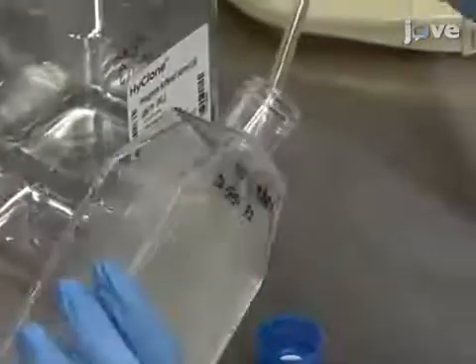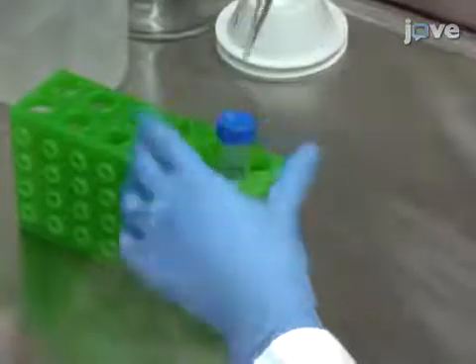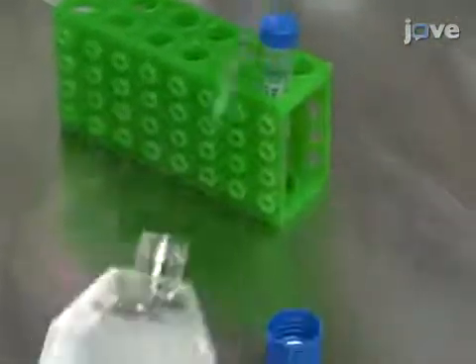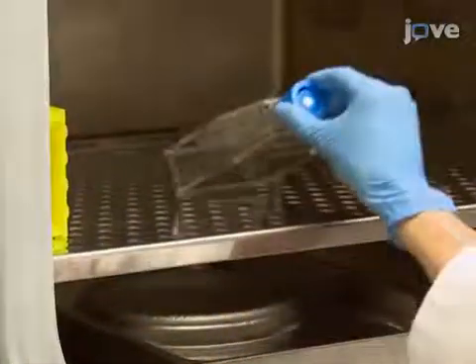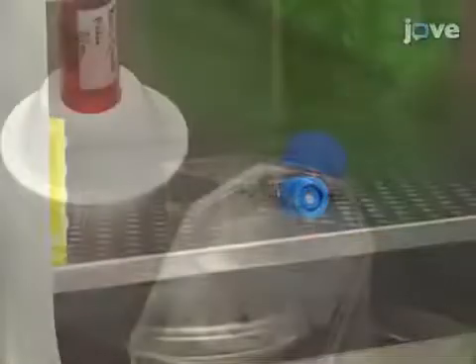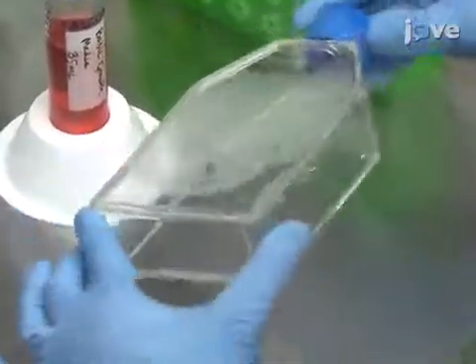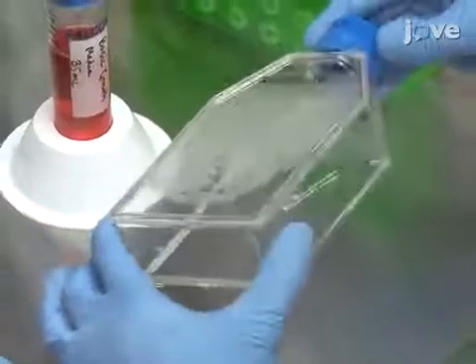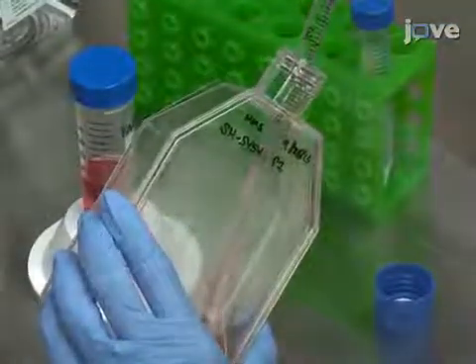Next, aspirate the PBS and add 2.5 milliliters of 0.05% or 1x trypsin EDTA. After that, incubate the cells for 2 to 3 minutes. Then, tip the flask gently to release the cells from the surface. Subsequently, add 10 milliliters of basic growth media and triturate the cells 1 to 2 times.